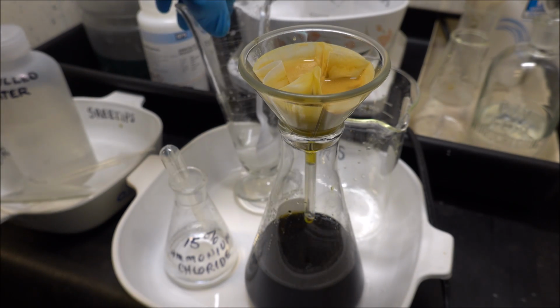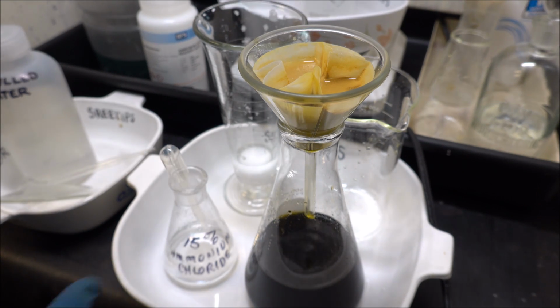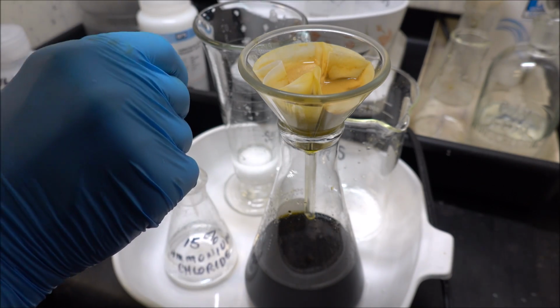I'm going to add the rest of the ammonium chloride that we did not use earlier into my little bottle here. Save it for my next batch.